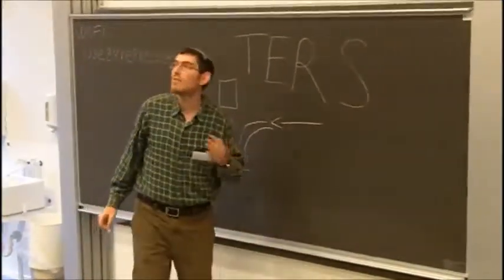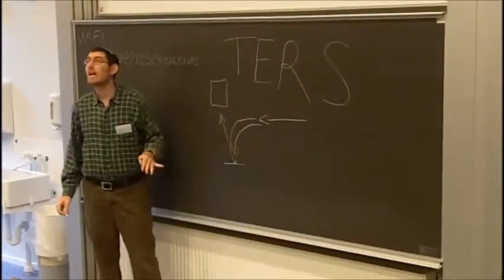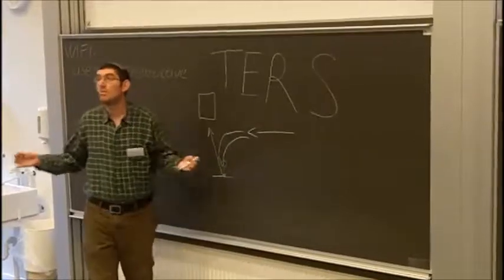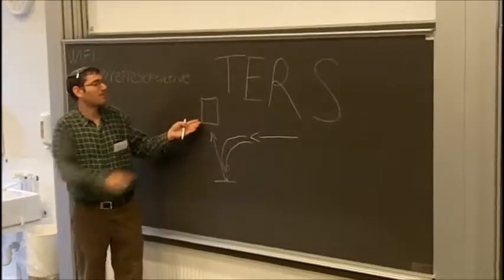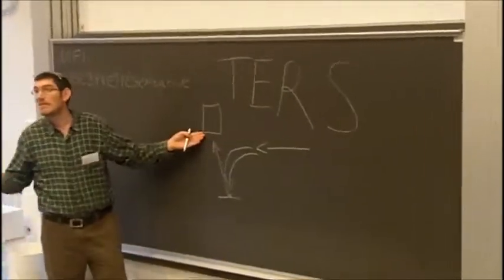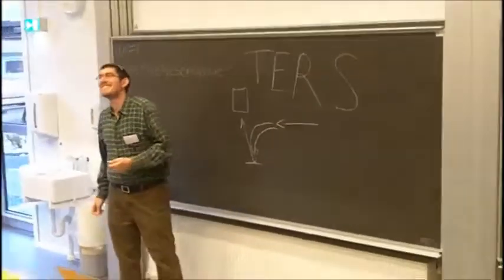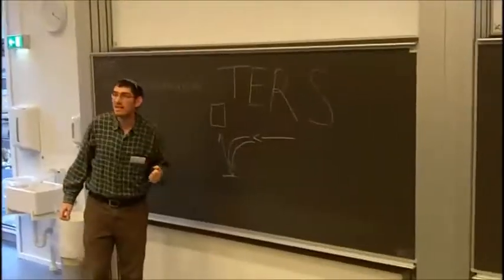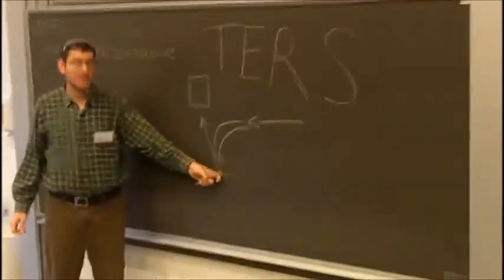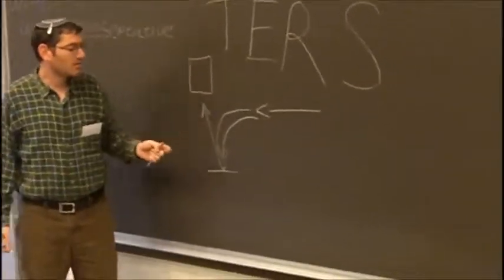Anyone have an idea why we can't, let's say, excite, for example, silicon through a 50 nanometer aperture? We'd get a much better Raman resolution, only 50 nanometers, and collect that Raman with a spectrometer. Anyone have an idea why that's not possible? Anyone want to guess? Intensity? Exactly. Through a 50 nanometer aperture, we cannot illuminate enough intensity to excite the sample to get a Raman spectrum. So what we do is called TERS.